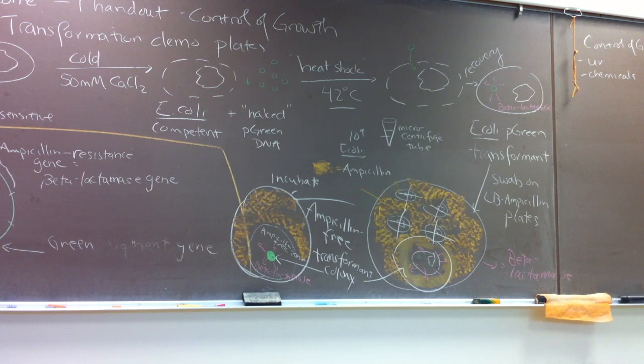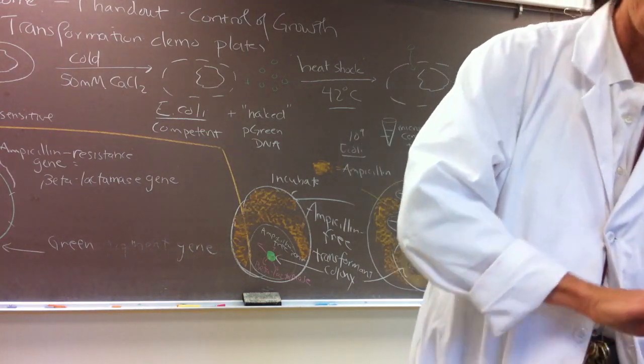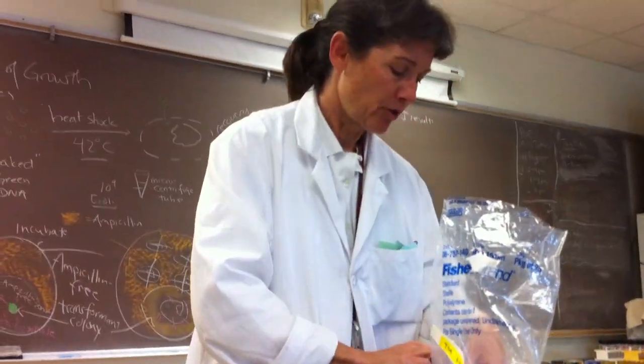Transformation plate. No wonder I couldn't find them. Okay. What we'll do is we'll put these on a little tray. But these things are gorgeous, you guys.